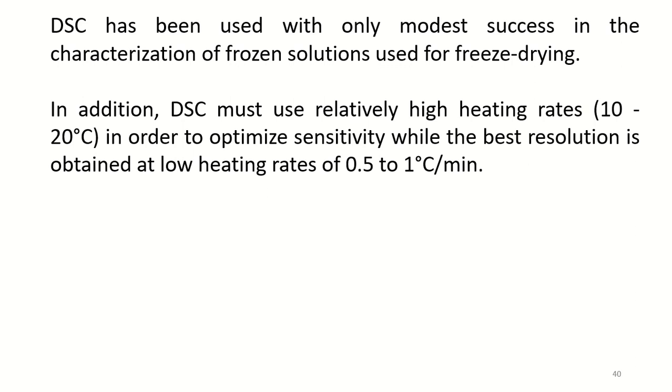In addition to this, the resulting modulated heat flow can be separated into heat capacity and kinetic components of the total heat flow in order to improve ease of data interpretation.